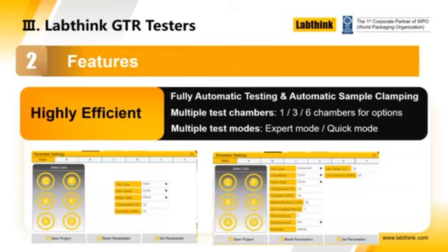And then there is a mode which we call expert scientific mode, where you can control the temperature. If the equipment is equipped with a humidity generator, you can control the humidity conditions. You can control the zero and the purging times, the preheating, whether some other features such as compensation are involved, and so on and so forth.